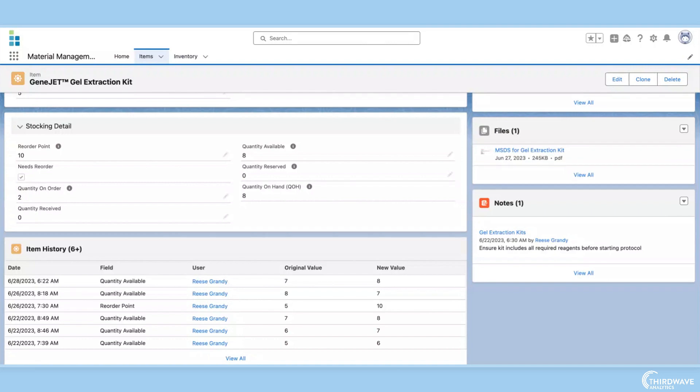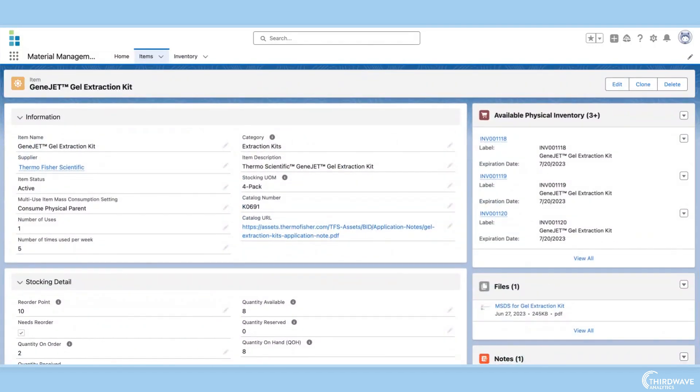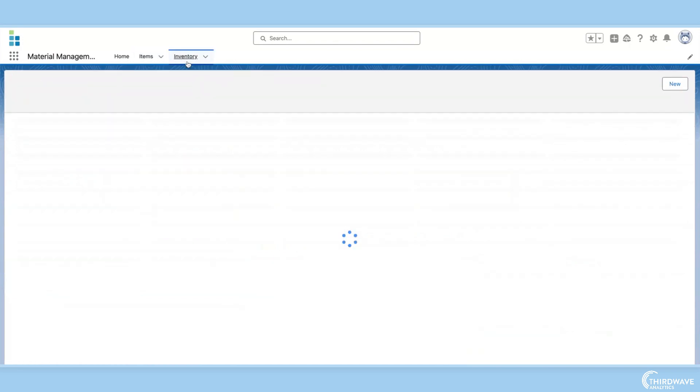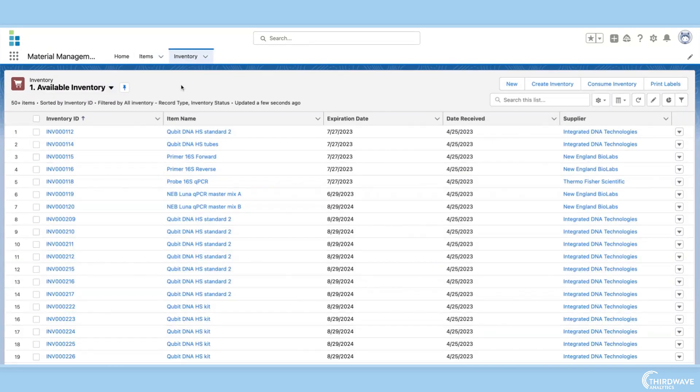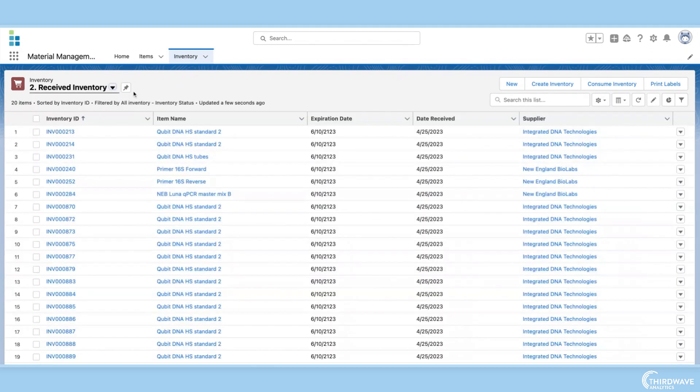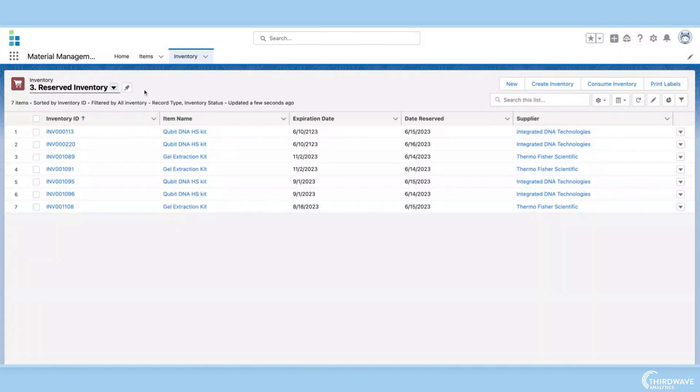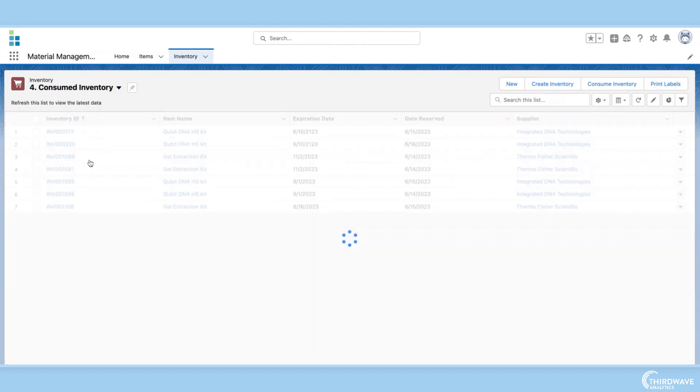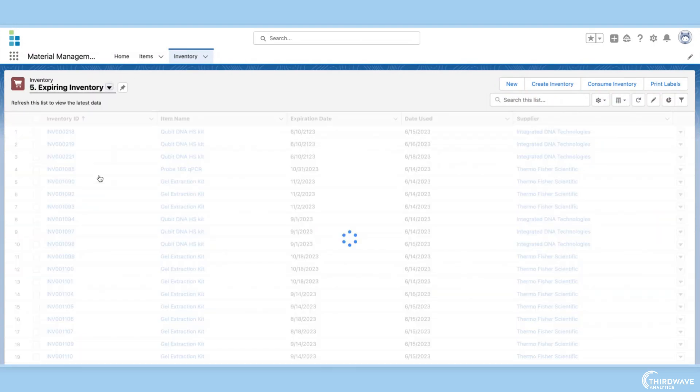Now that we've seen an item record page, let's go to the inventory tab to explore inventory management in more detail. Here we see a list view of all the inventory in the lab. We can filter this list view to see all the inventory records or just those that have been received, reserved, consumed, or are expiring.